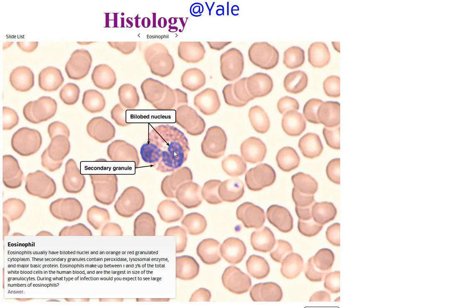These guys are a little bigger even than the neutrophils. They're about twice the size of a red blood cell, and they are involved in a very specific type of immune response. So if we have an allergic reaction to hay, or if we get hives, these eosinophils are going to have that immune response. So they are what will induce that allergic reaction.